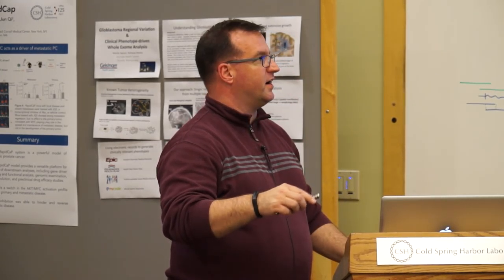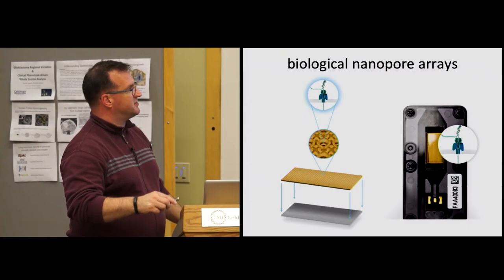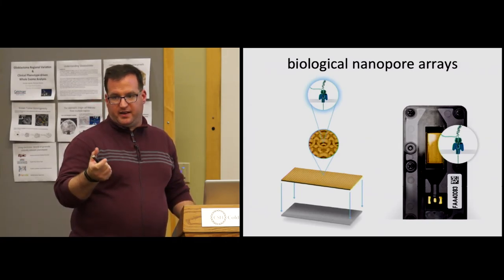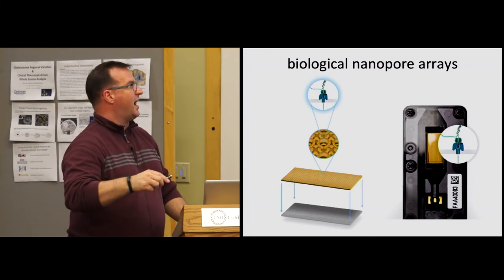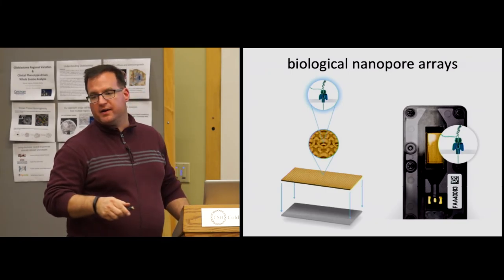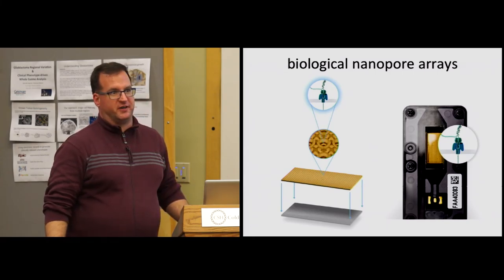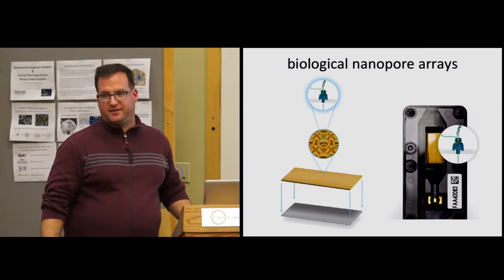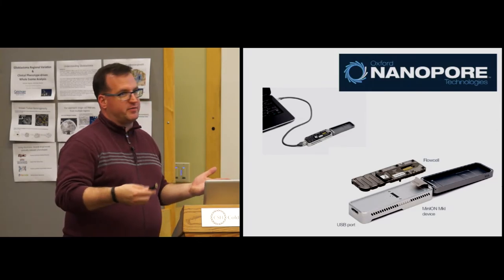Super cheap, because these things are cheap to make. I think the expensive part is the integrated electronic circuit. Sitting underneath every one of these pores has to be the circuit that senses the change in the voltage at that one pore, distinct from the pore next to it. But it's solid state circuitry, like Radio Shack stuff. So I think these things are like $100.